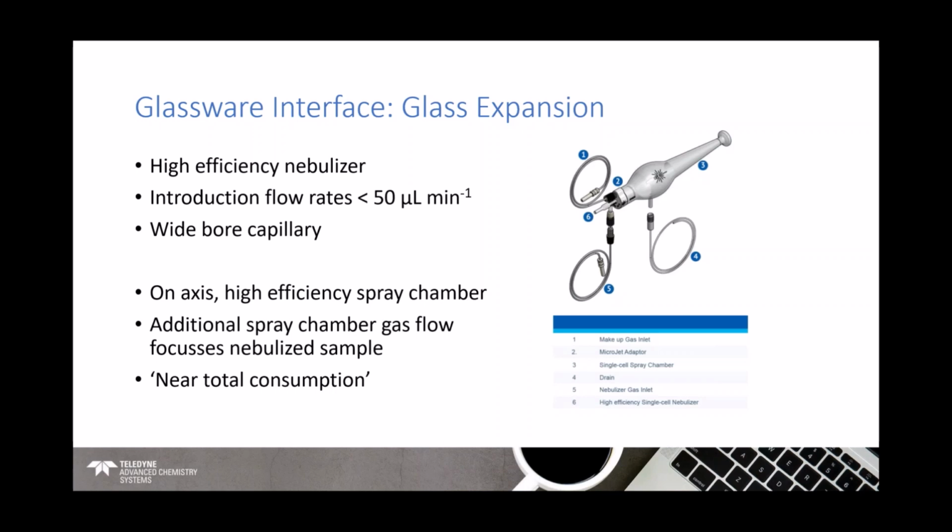The intention there is to make sure that your cells have got some room to move, that you're not forcing your cells together prior to reaching the tip of the nebulizer for the nebulization process. Again, you're trying to avoid cells lysing, splitting in this process. So you're trying to make sure that they maintain that integrity through the process.